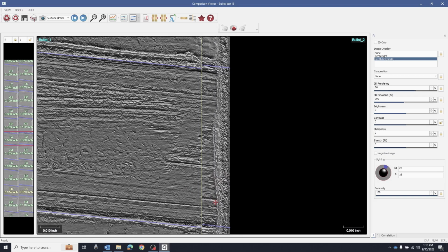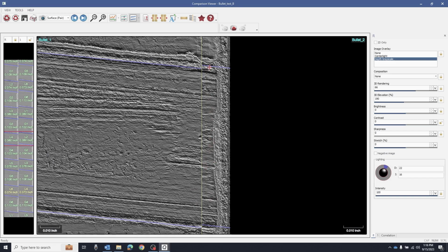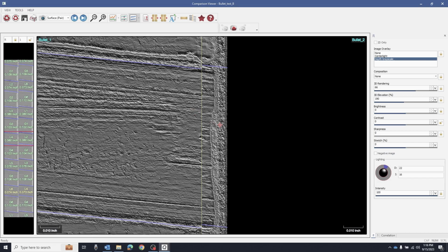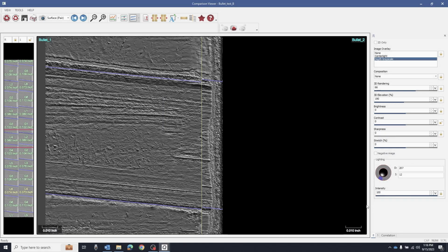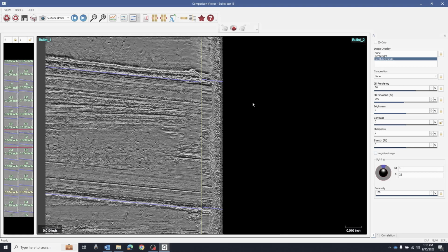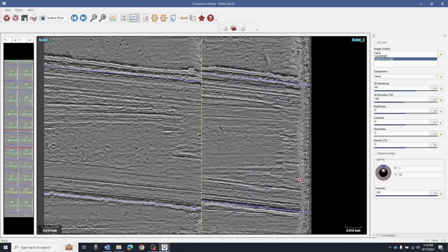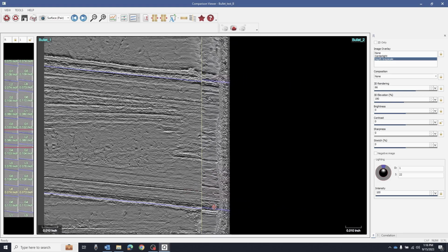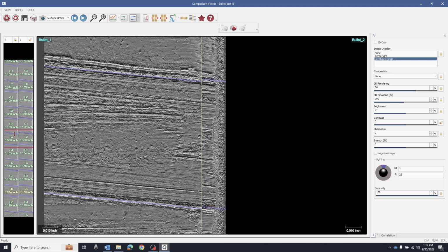And that's interesting. This big feature did not seem to happen at all here, but something big dead center. While the shoulders are lined up, there's some big stuff happening in the middle, but not so much towards the bottom. Let me zoom out one and then see if changing the shadows brings anything new to light. There's still good agreement, but whatever that big feature there is, wow, it's a huge feature, did not happen on the other one. And that was 4 to 2.